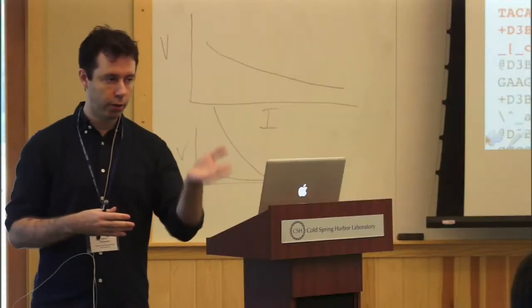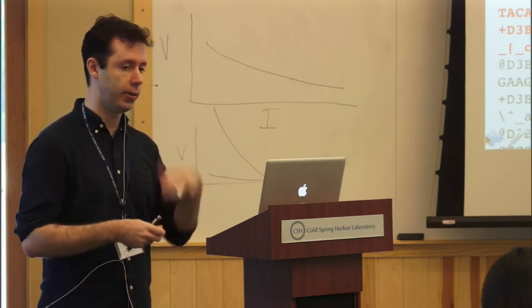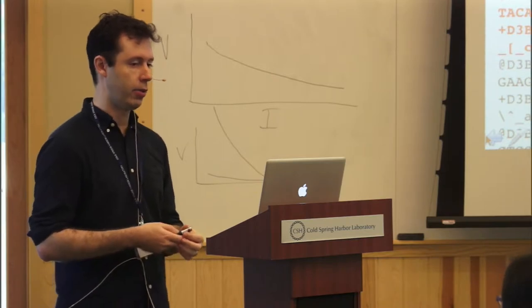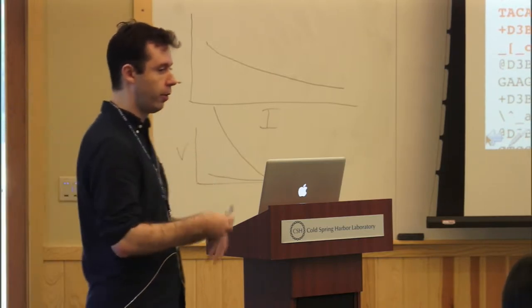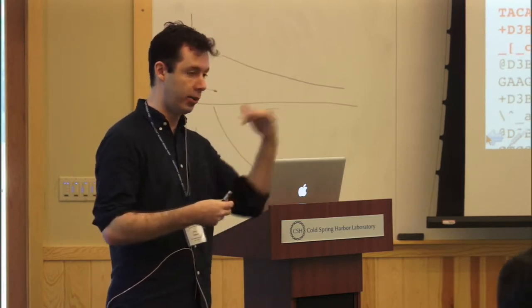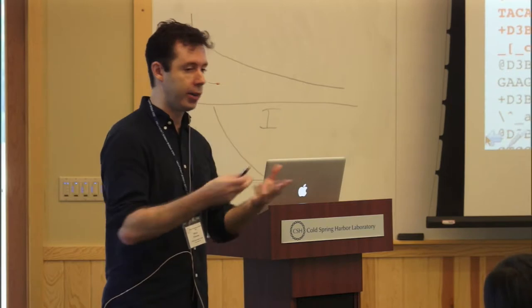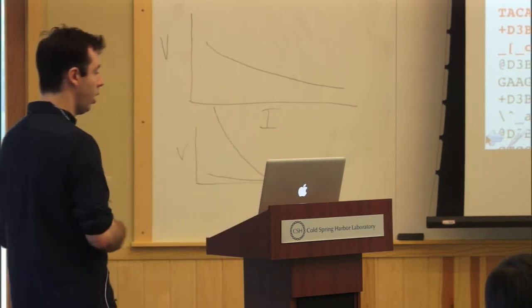So, this quality score 30 is a threshold that's being used, or the number of nucleotides that are above Q30, which is the standard threshold of Illumina sequencing. That tells you something about the quality of the run. For example, you really want to maximize that Q30 number. You want it to be as high as possible, 80%, 90% of your nucleotides should be Q30 or more.